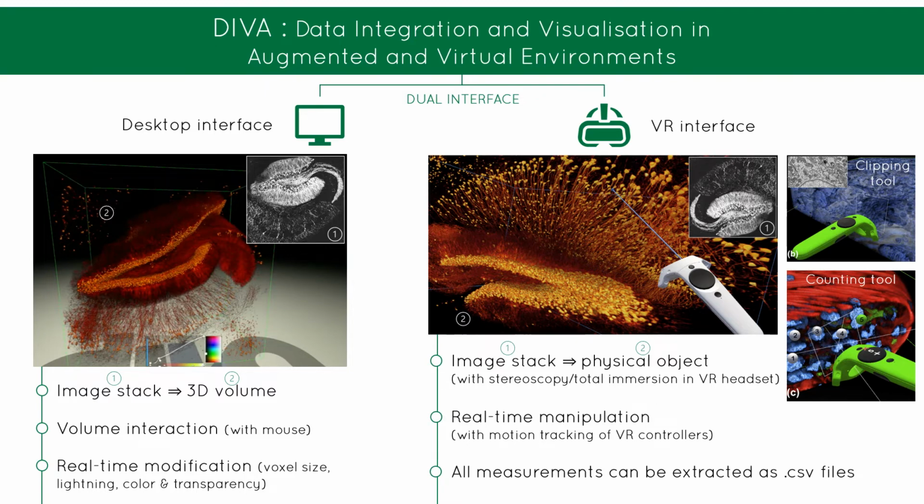In this virtual environment, you can do some real-time manipulation with the VR controllers. These controllers can also be used as a clipping and counting tool. All the measurements can be extracted as CSV files.